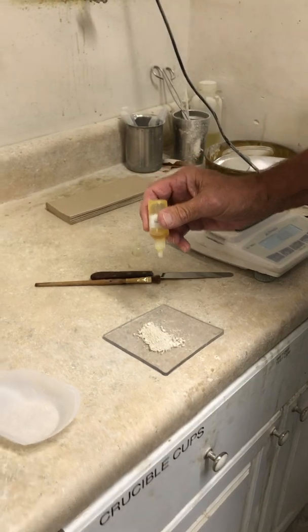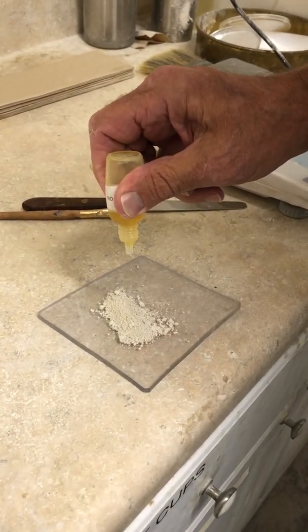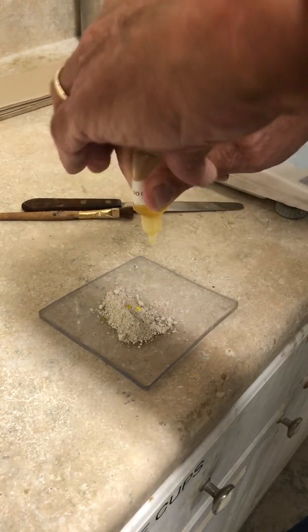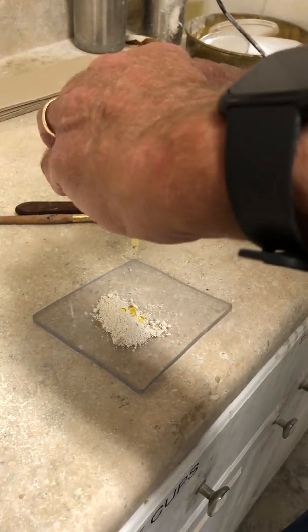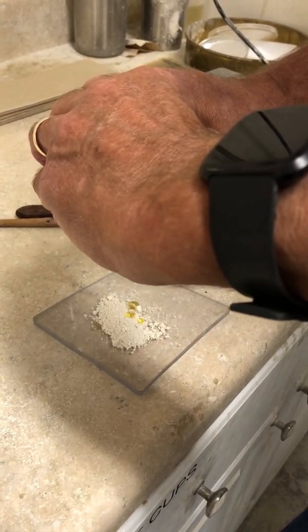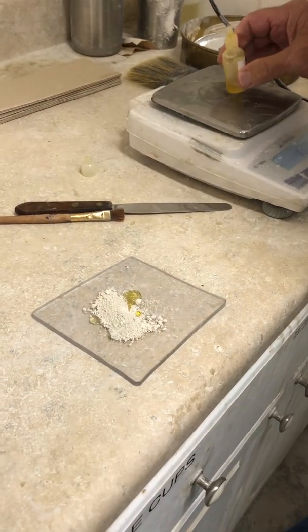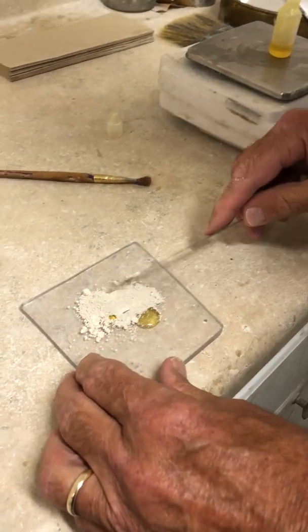From a previous test, I'm going to start off with about maybe 16 drops. Okay, that's 16. I'll set that back on the scale.